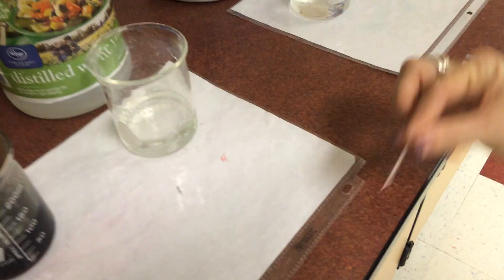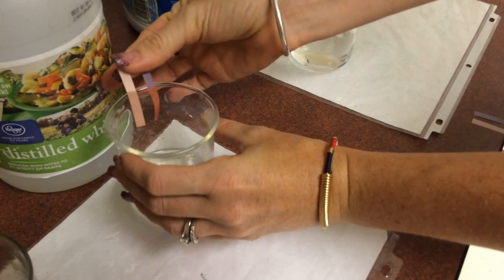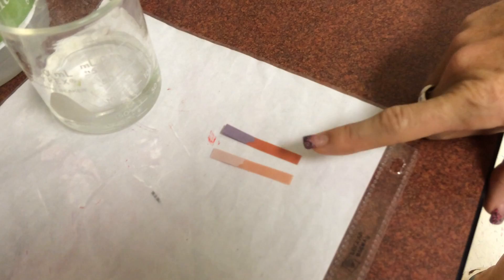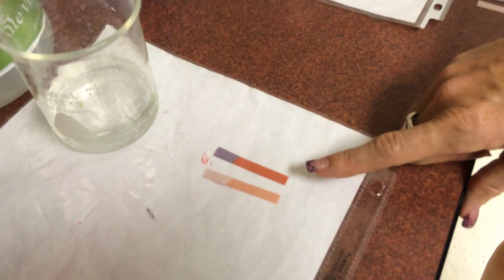Moving on to vinegar. If I dip this in here, you can see really dramatically that the red stayed red and the blue turned a nice red. So vinegar is - that's right - an acid.